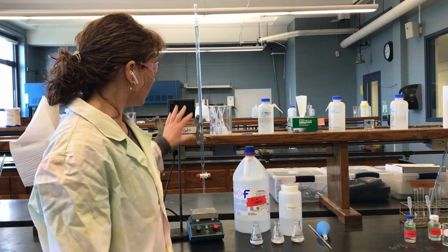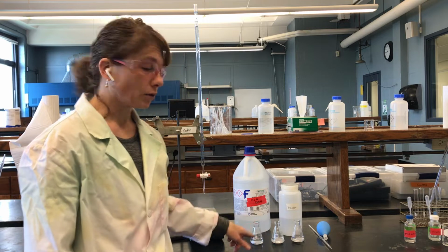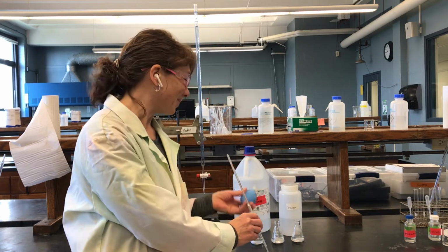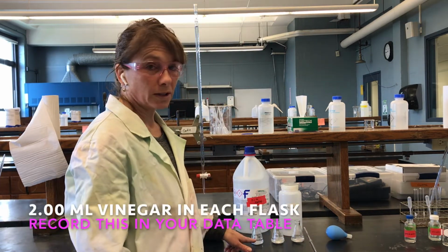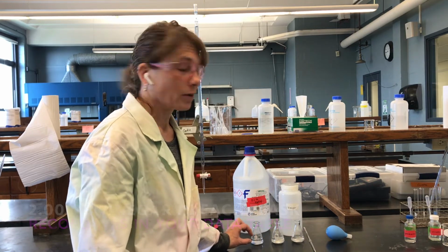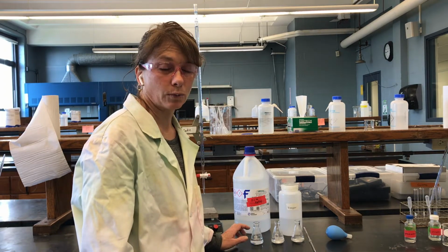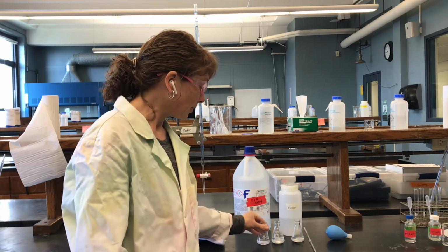So I've already filled the burette with our titrant, with our sodium hydroxide. In each of our 3 trials, our 3 Erlenmeyer flasks, I used a 2 mL volumetric pipette. With your pipette bulb, I bet you're thrilled to not have to do this, but I used the 2 mL volumetric pipette to put exactly 2.00 mLs of vinegar in each of the 3 flasks. And then you'll notice this is slightly more than 2 mLs. You have to add some water just so you have something to mix, just a little bit of volume in there. So I added about 25 mLs of water. The amount of water does not matter. Again, it's just so that the stir bar, which we have in here, has something to stir.